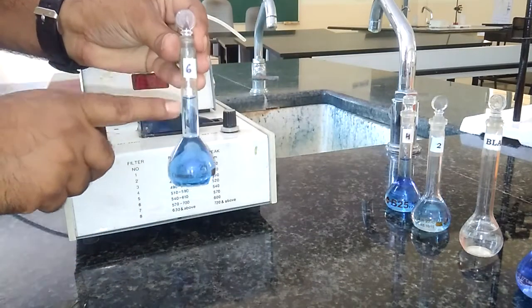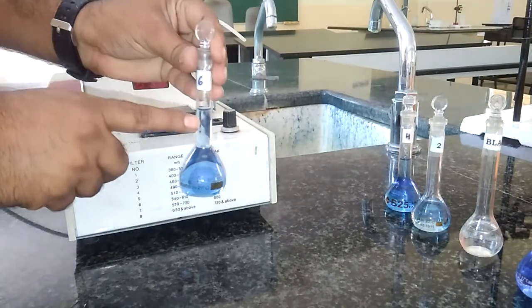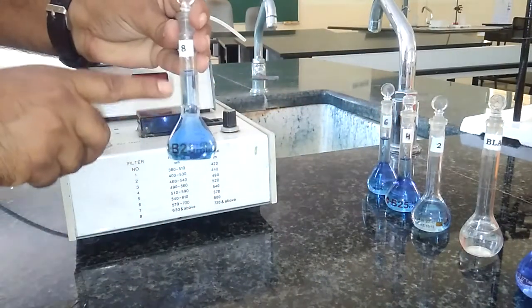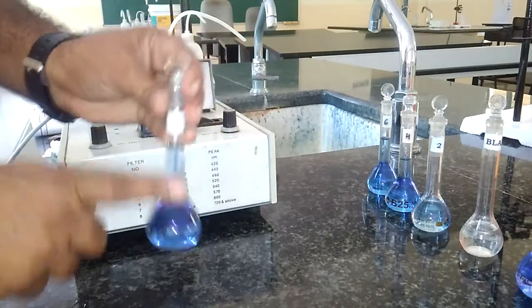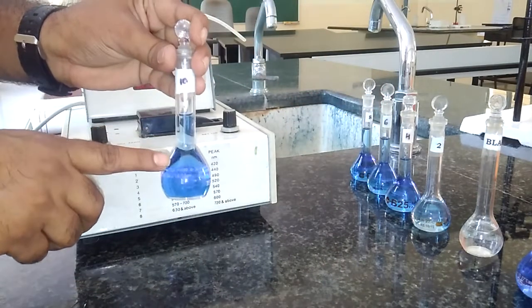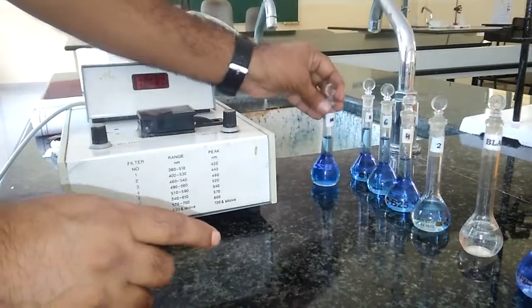Similarly, the 6 ml standard is prepared with 6 ml of copper sulfate, 2.5 ml of ammonia, and distilled water. The 8 ml standard is prepared with 8 ml of copper sulfate, 2.5 ml of ammonia, and distilled water. At the end, the 10 ml standard is prepared by adding 2.5 ml of ammonia with the rest being water.